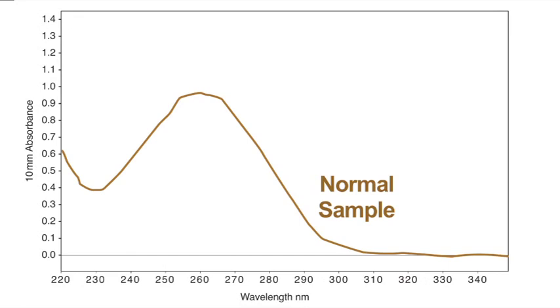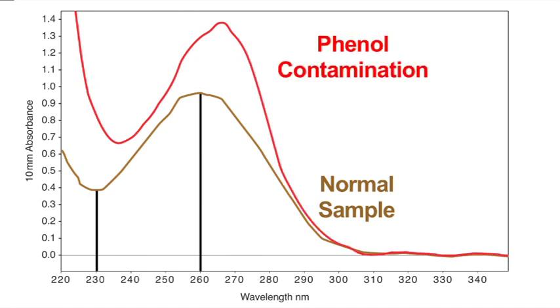Spectral indicators of a poor quality sample include wavelength shifts in the trough and in the 260-nm peak.